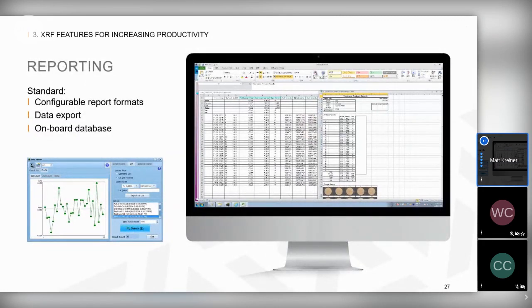Sometimes the XRF results are used for quick go/no-go decisions for quality or production control. In other cases full reports are necessary, either for internal purposes or to be sent to customers. From the results screen in the controlling software you can create different kinds of reports. The data output format on the left side of the monitor has just rows of data, good for linking to a quality system or copying into another report. The customer report on the right is a more comprehensive printout including measurements, statistics, trends, and sample images. All measurements are stored in a database that can be accessed by opening the data viewer from the routine analysis screen. You can search for data based on date range or lot information and show the raw data or trends. You can print a report from the data viewer by right clicking in the results list.